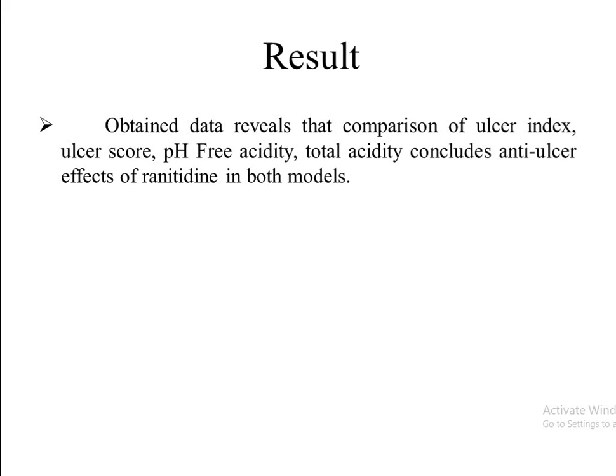So this is all about the study of anti-ulcer activity of a drug using the pylorus ligation and NSAID induced rat model. Thank you very much.